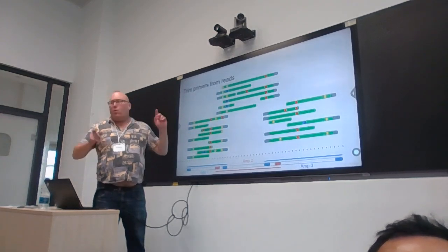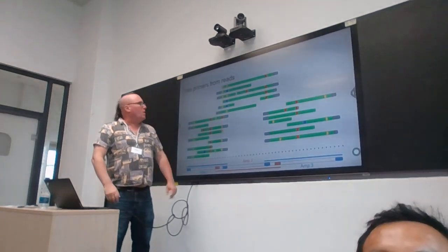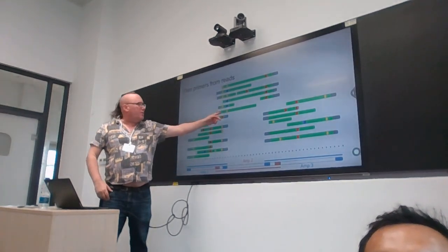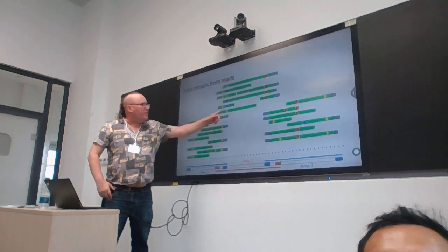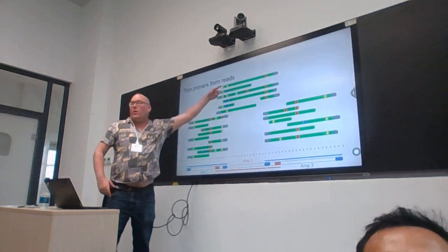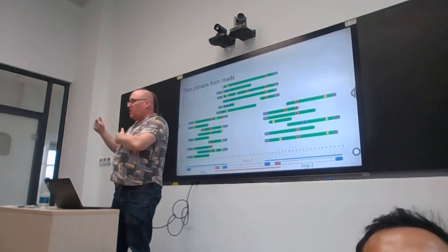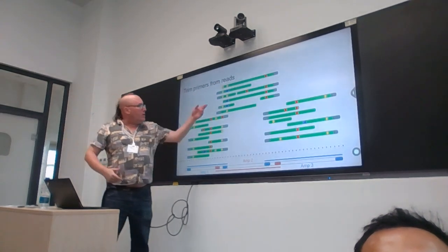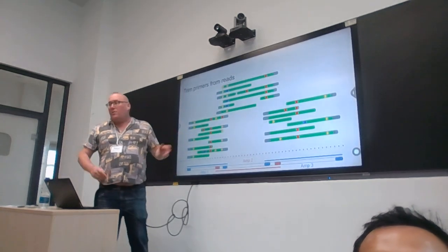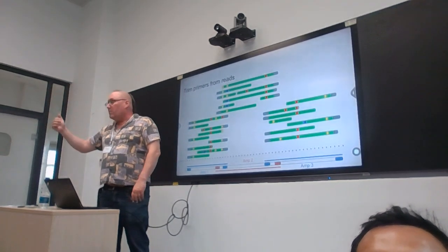Okay, and now we don't lose data because everything is overlapping. Even though we're taking that one out of this read, those reads are overlapping with this thing. So that's why it's an overlapping primer system, tiled primers. Okay. Then we trim these primers, and to do the primer trimming, we need to have that bed file that tells us where the primers are, okay?